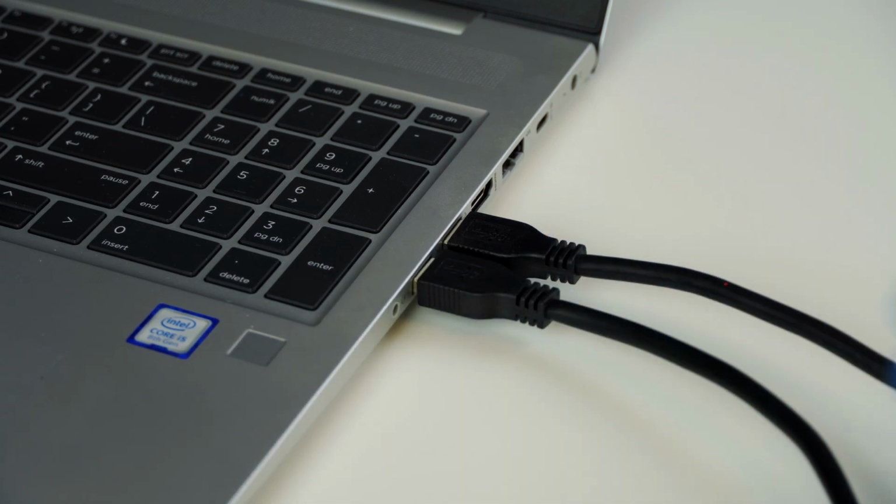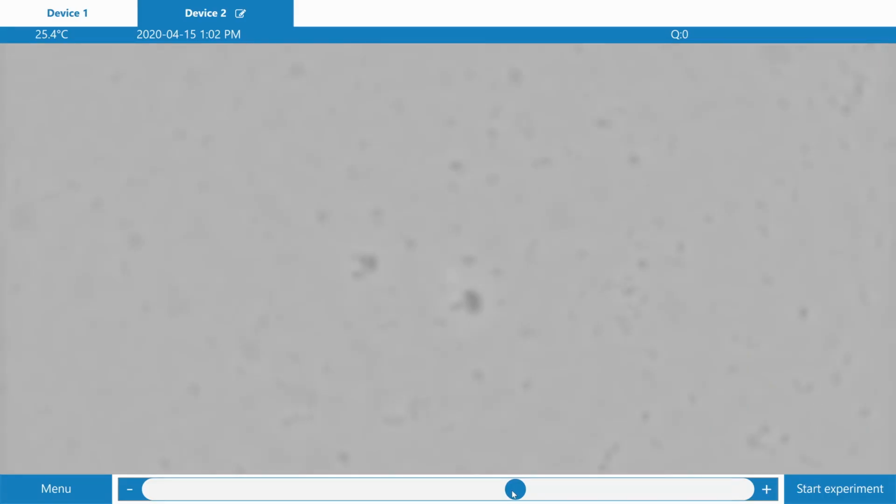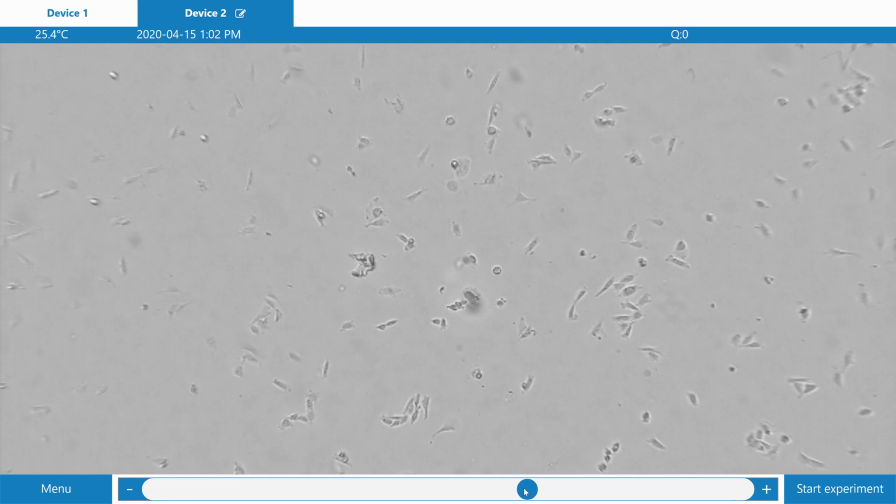The focus setting is reflected in real time on the screen. Simply slide the blue dot along the focus track. For fine focus adjustments, try pressing the plus or minus buttons at the bottom of the screen. Once in focus, you can start the experiment by selecting the button on the bottom right corner of the screen.